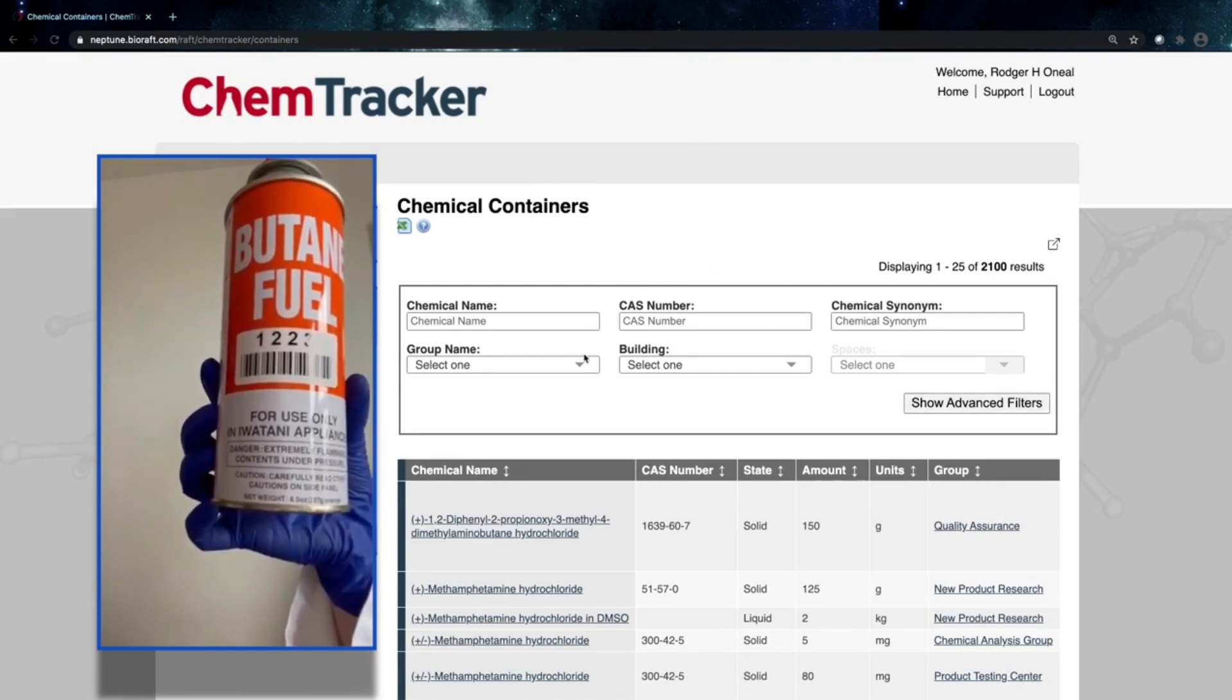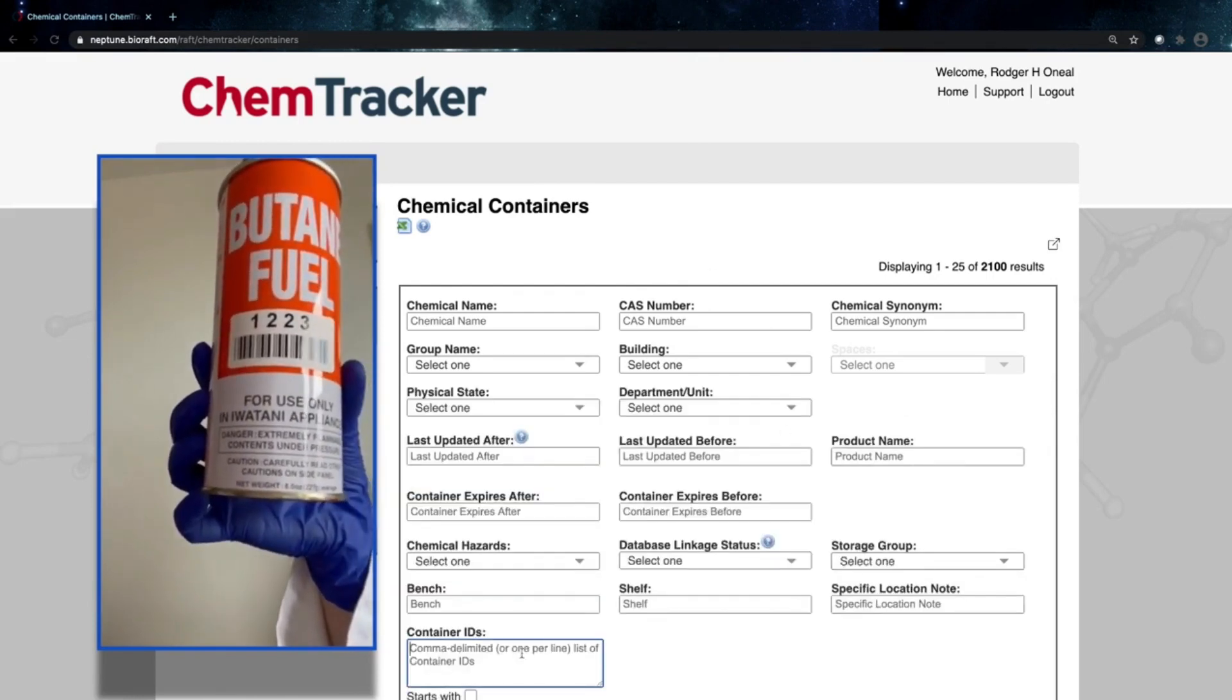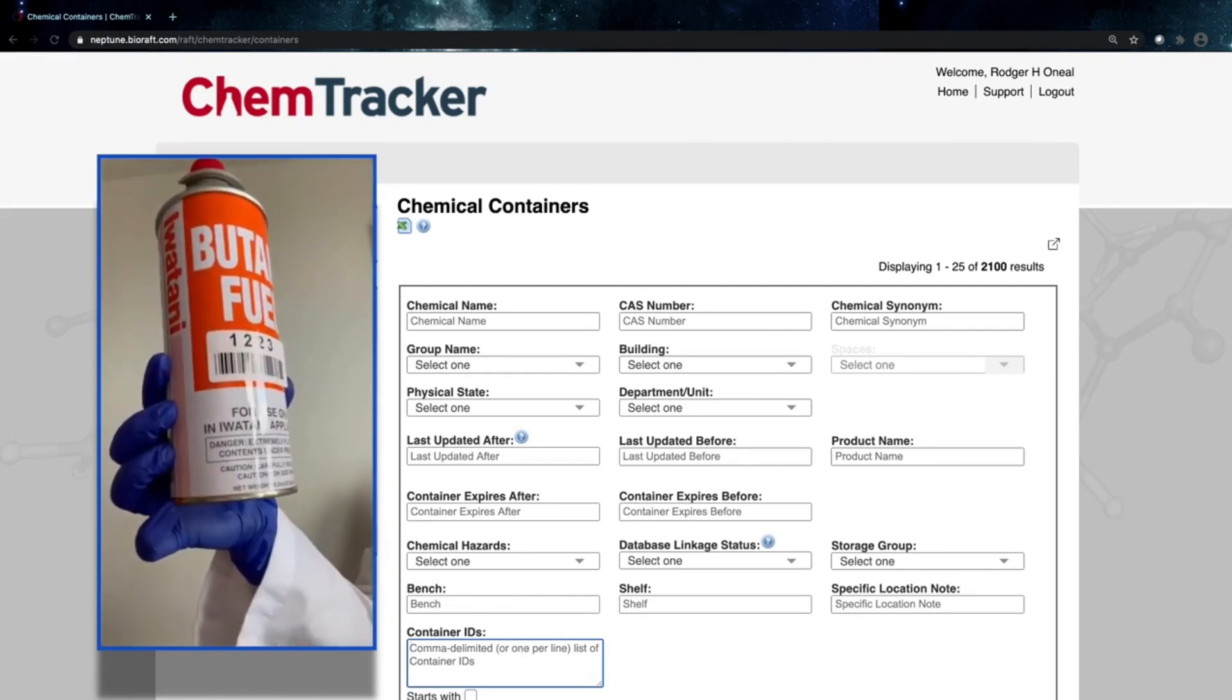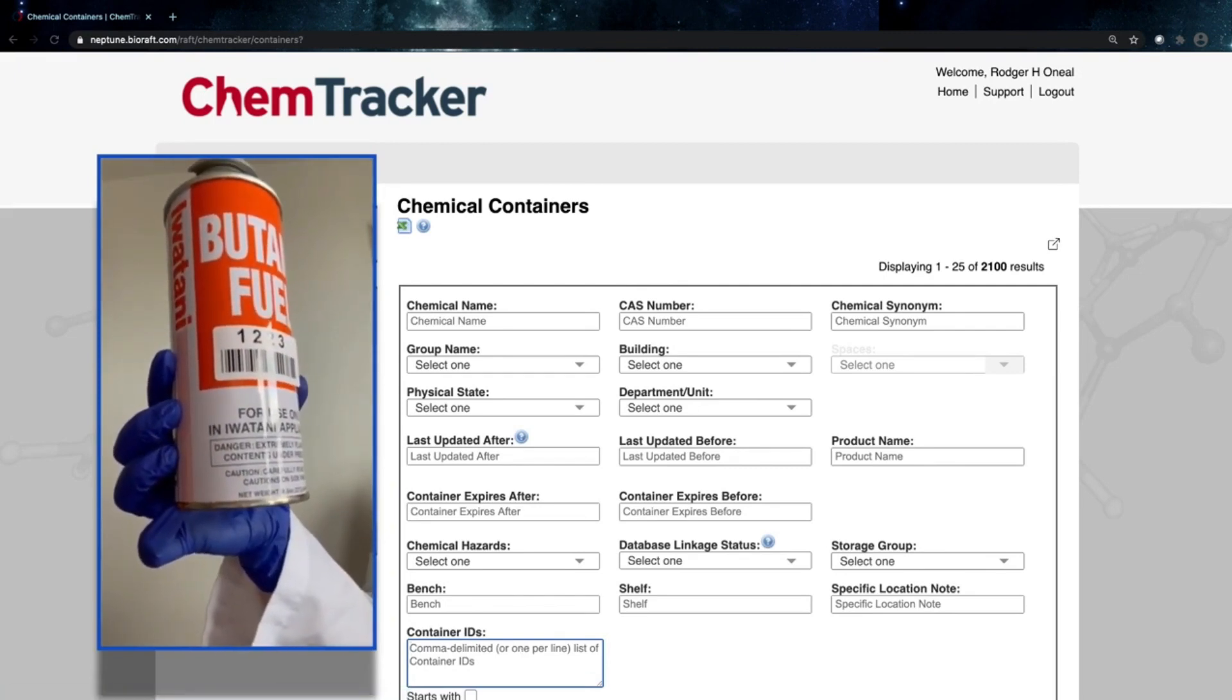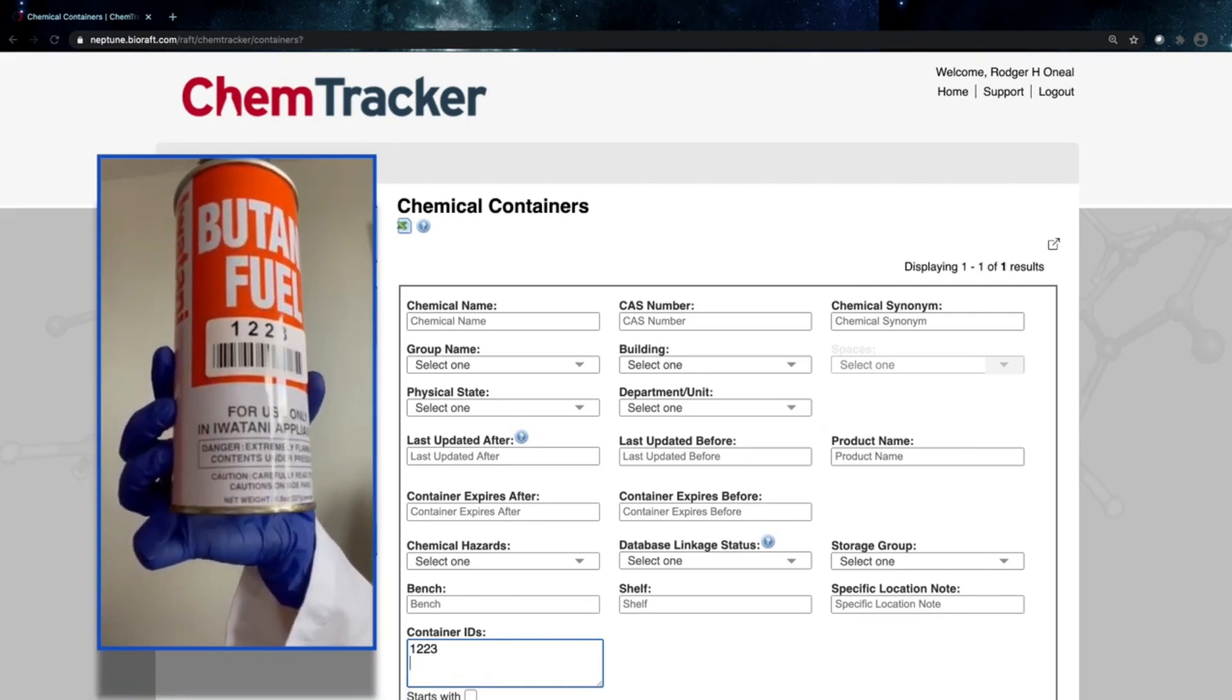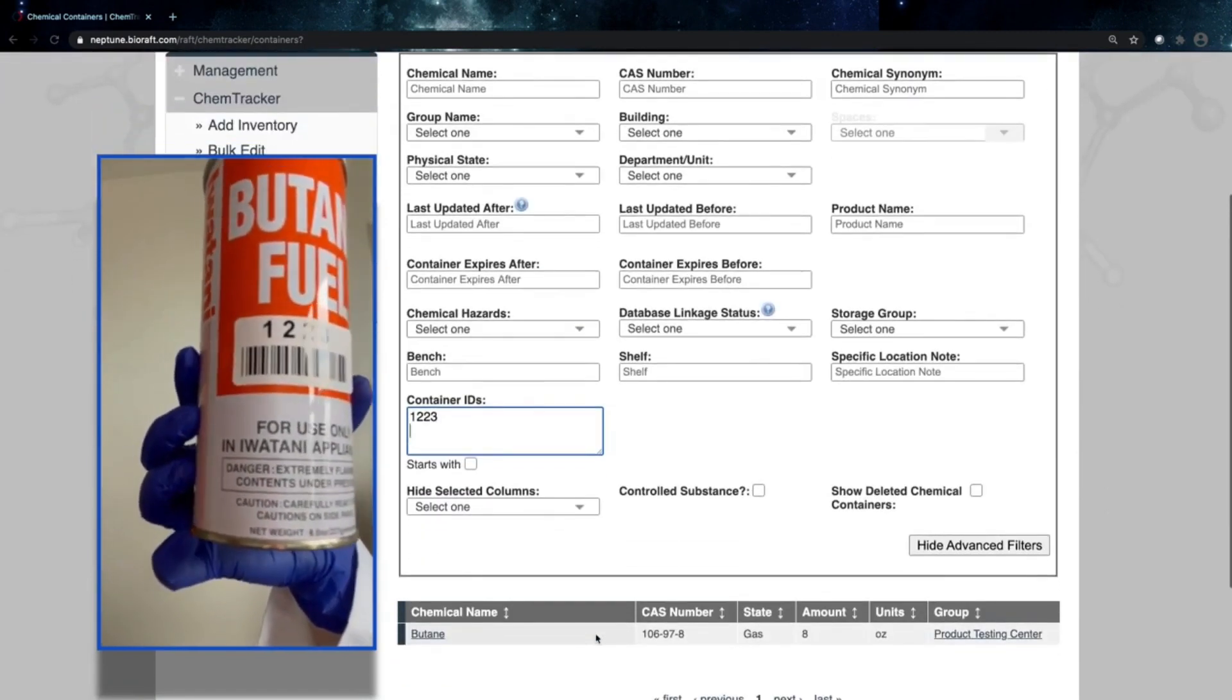So on my chemical containers page, I have an option to scan this and scan a whole bunch of container IDs if I wanted to. I'm going to scan this one in particular. And it's going to go ahead and show me, right, I have that container ID here. And it went ahead and found that container.